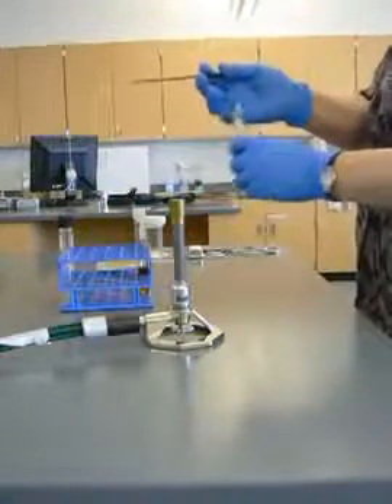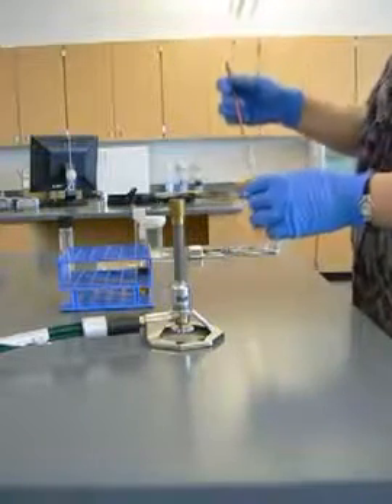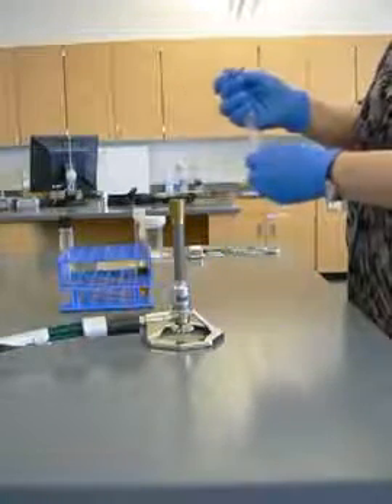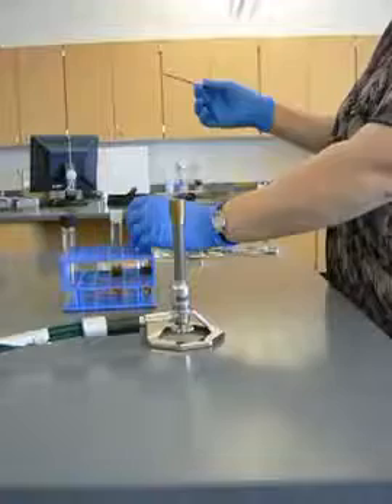I'm going to grab the lid with my little finger here, pass that through the flame, and I go without touching the glass. I'm turning the tube, not the lid. I'm moving my hands, holding the loop as little as possible.